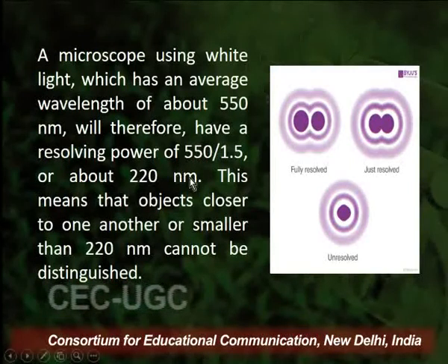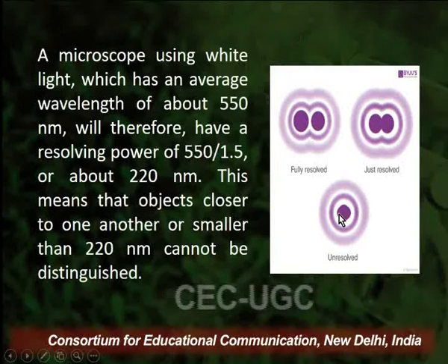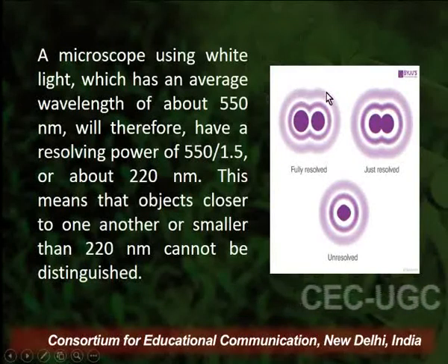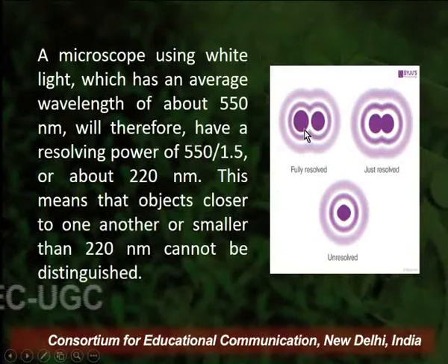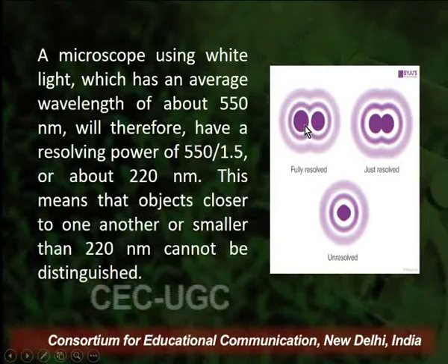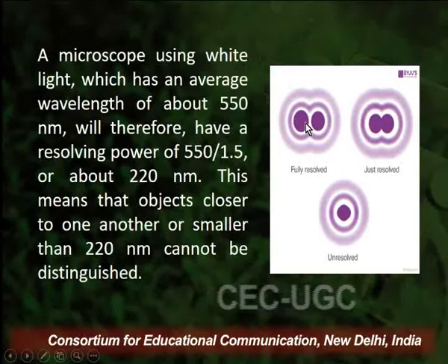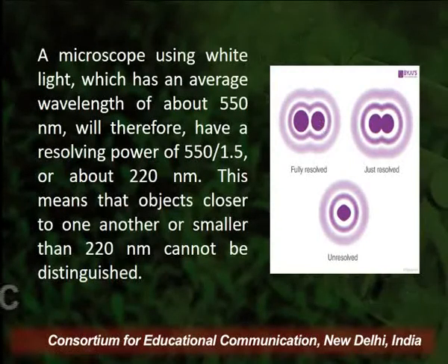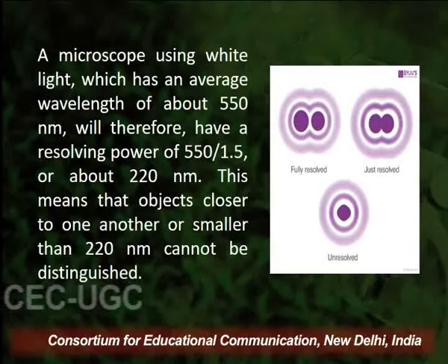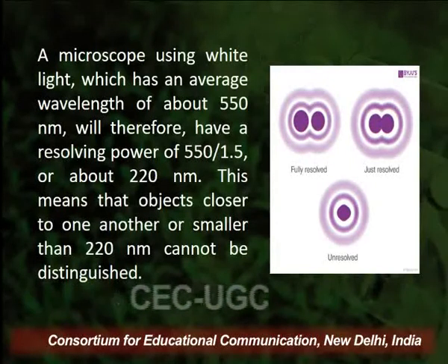So that is the meaning of resolution. Any objects which are placed together at a distance less than 200 or 220 nanometer cannot theoretically be distinguished with the help of a microscope which uses white light.